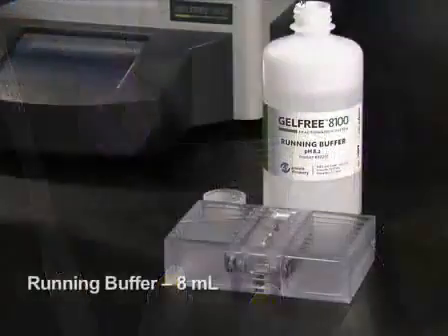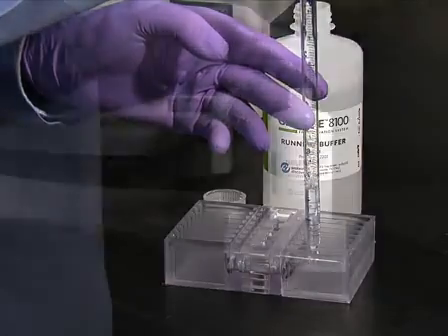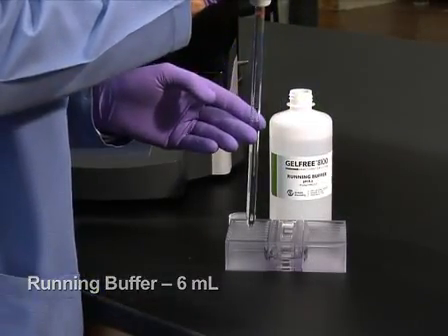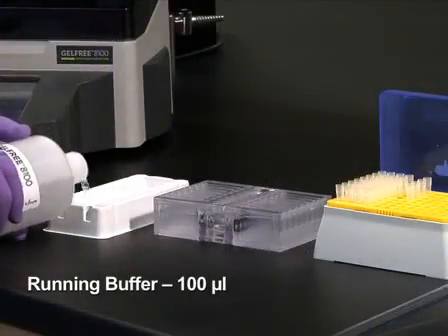8 milliliters of GelFree running buffer is added to each of the anode buffer reservoirs, 6 milliliters is added to each of the cathode buffer reservoirs, and 100 microliters is pipetted into each of the collection chambers.